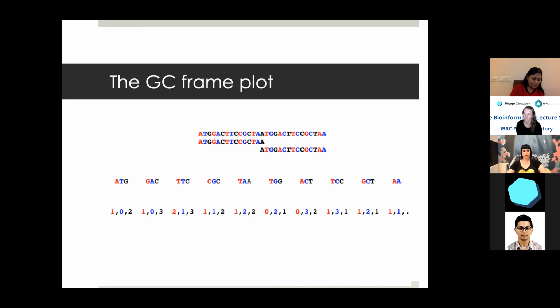So one of the things that I've always shied away from in any kind of computational machine learning program that I develop is references, because the lowest hanging fruit is using a reference database to predict stuff, because it's really easy. That's why things like GeneMark and Glimmer work so well: they use a reference database. If you take your phage genome, do a single mutation to it, and annotate again, the other programs already know what the genome looks like. So using references works really well for things that are very similar to things you already know, and that's the one benefit of it. But anytime you get something that's highly divergent or just very different, which is quite common in phages, using reference databases can lead to missing a lot of stuff.